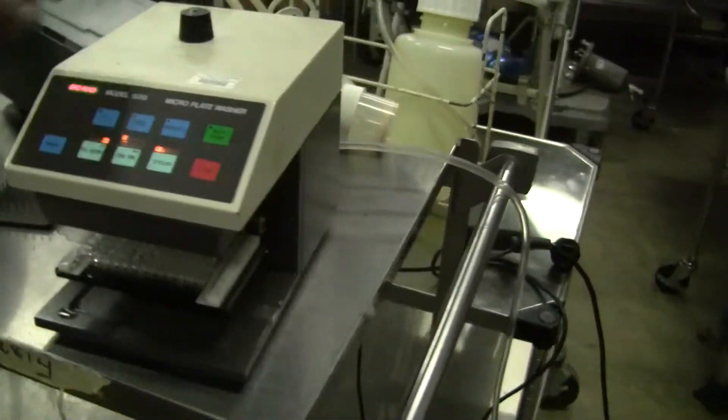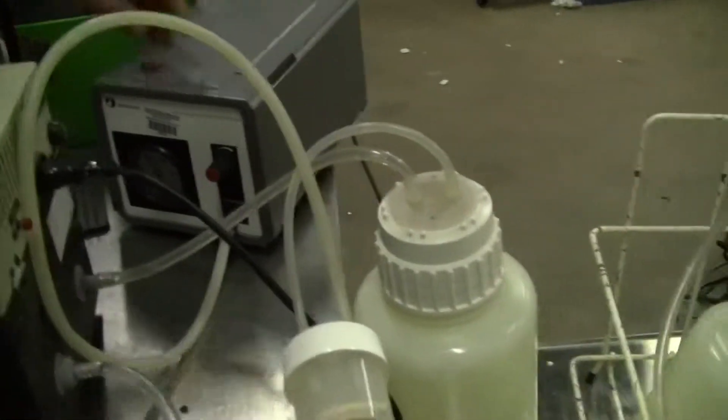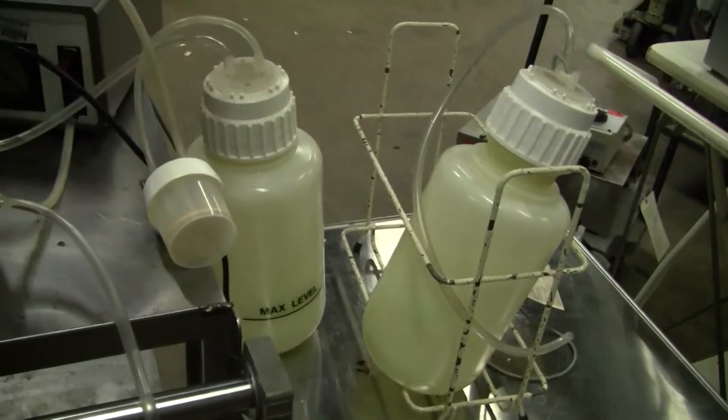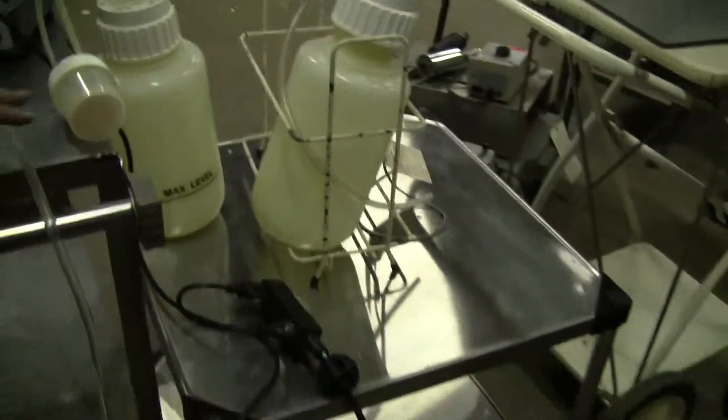We have jury-rigged a vacuum pump into a clutching vessel. This is our vessel, but the vacuum pump is for sale. We have a water feed line here that we put a little green dye in.